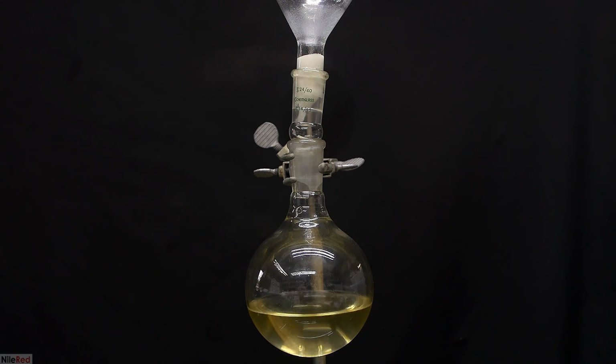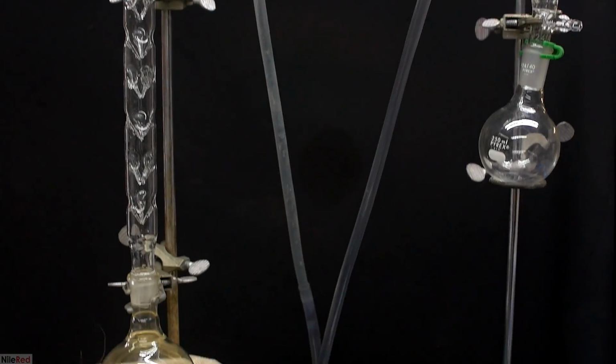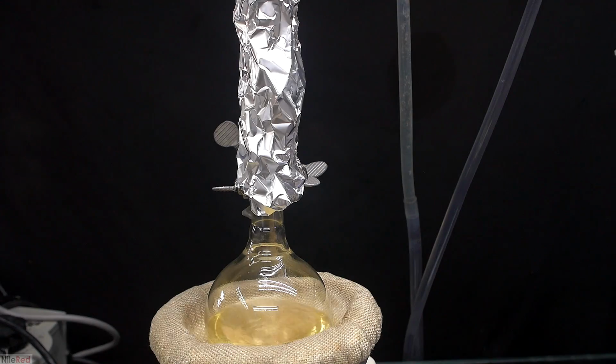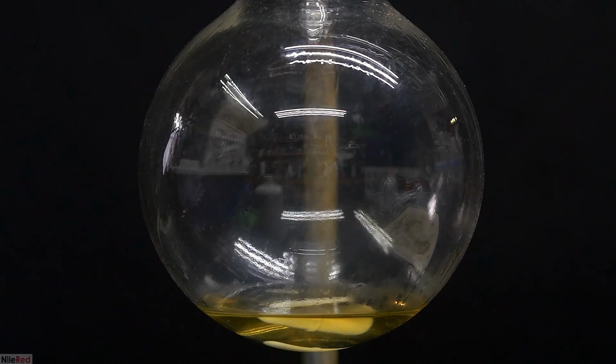I set up a fractional distillation to remove the diethyl ether, but I probably could have gotten away with just a simple one. I turn on the heating as well as the stirring, and then I insulate the column with a little bit of aluminum foil. It doesn't take very long for the diethyl ether to start pouring over. Once all of the diethyl ether had been removed, it's time to add what remains to a smaller flask.